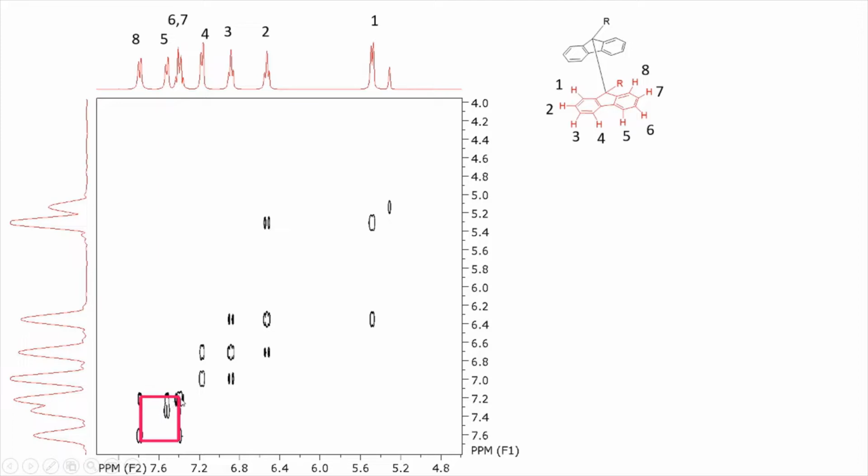So if you take that as a 7, then that will not be correlated with the 7. Again, if you think this is 7 and 6 is relating, so 6 and 7, but in that case 6 and 8 is not possible because 6 and 8 are away.